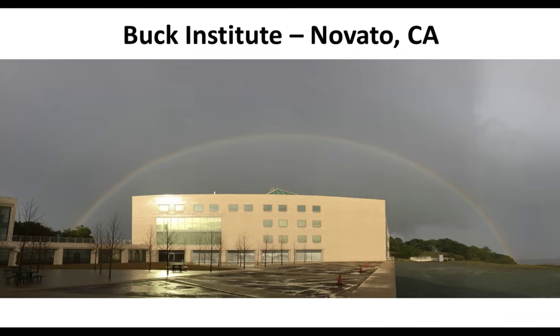A great example is the acetyl-lysine antibody. That's actually a mix of 7 different monoclonal clones, and we did that to really maximize coverage and get one reagent, one tool that should, in principle, be able to pull down any lysine acetylated peptide.